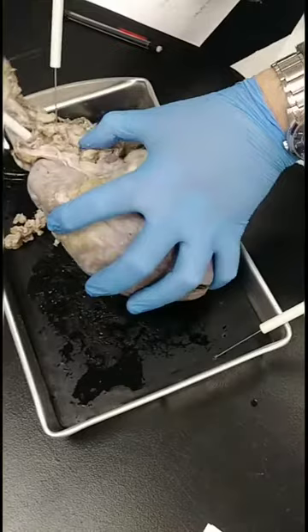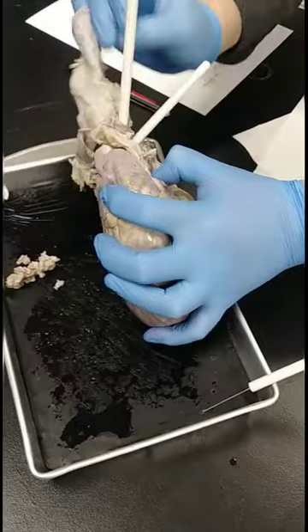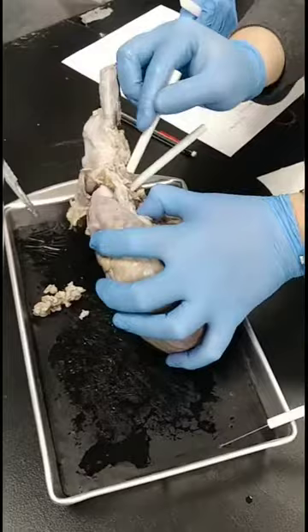Let's mark what you just uncovered there. Make sense? So you have a vein. This is much thinner than the artery. See how thin it is? This is the big aorta up here. Look at that thickness compared to this thickness. See that? Okay, take a look at step two.